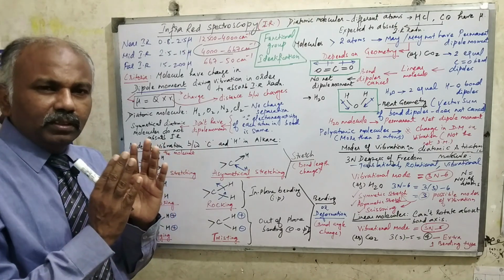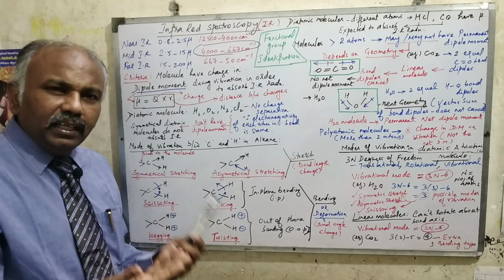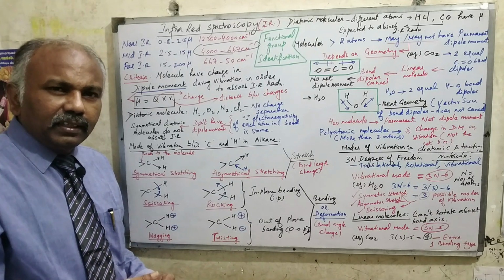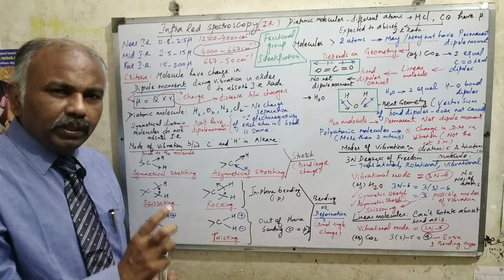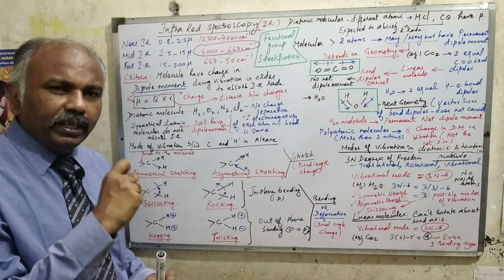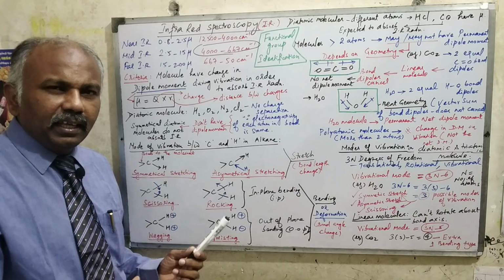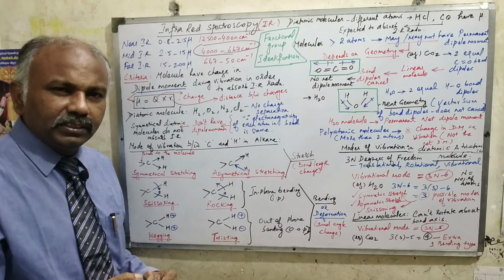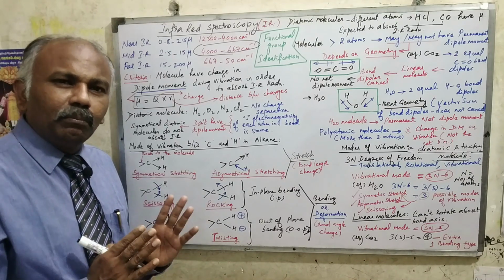So this is a general view of infrared spectroscopy. As I told, in infrared spectroscopy the energy is a little less as compared with the UV region. So in infrared spectroscopy, the molecules go for rotation followed by complete vibration in the structure. Vibration in the sense that they go for stretching and bending vibrations. And in infrared spectroscopy, we study the complete vibration pattern of the molecule.